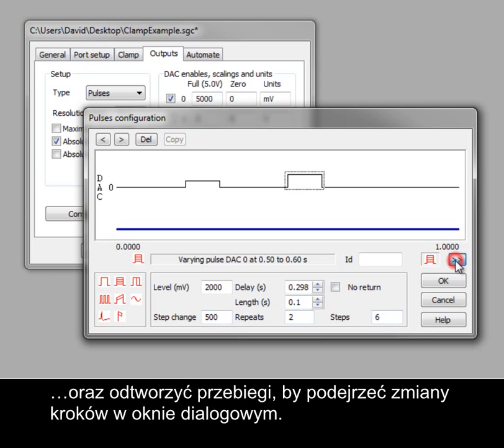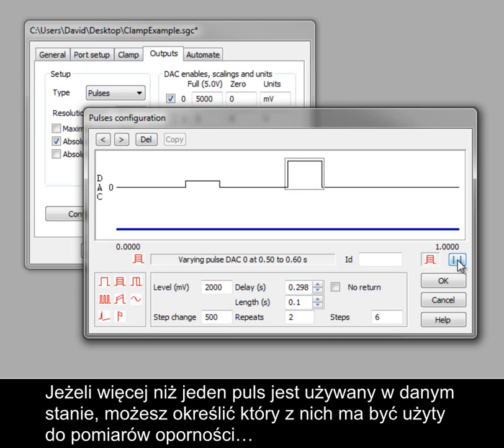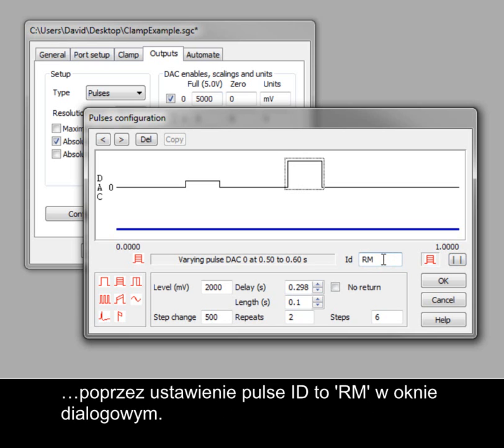And play through the sweeps to show the step change in the dialog. If more than one pulse is used for a given state, you can define the one to use for resistance measurements by setting the pulse ID to RM in the dialog.